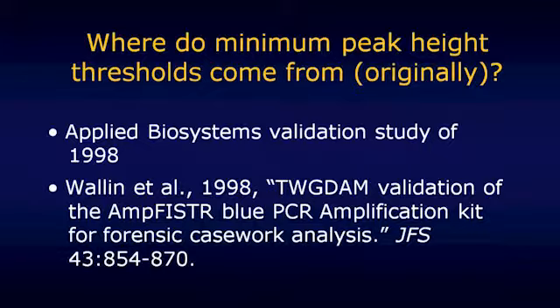Because I can tell you this, I've asked many DNA profiling analysts over the years, do you know of any other discipline? And I don't limit it to just DNA profiling experts. I've asked scientists, physicists, you name it, who else draws a line in the sand like that, a minimum peak height or a threshold above which you say you have signal, below which you don't?